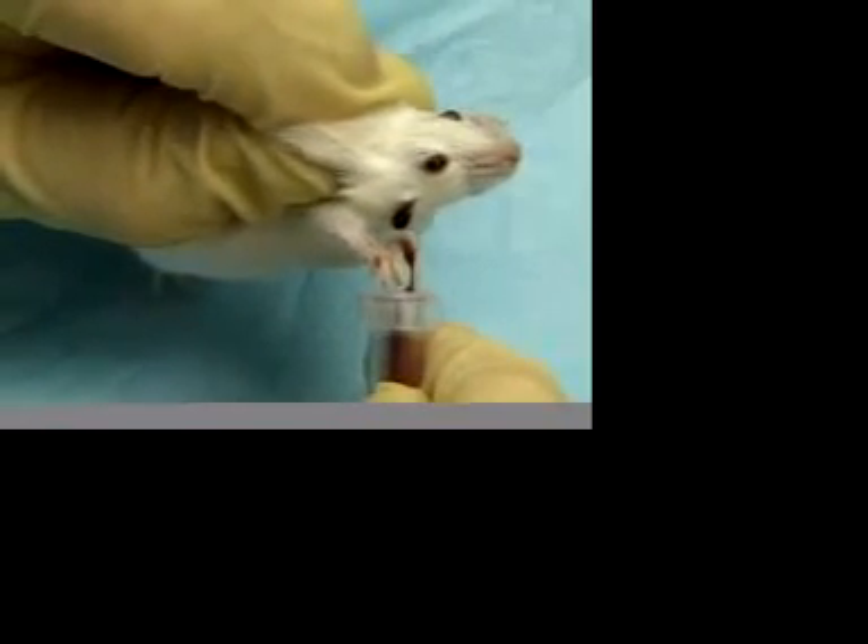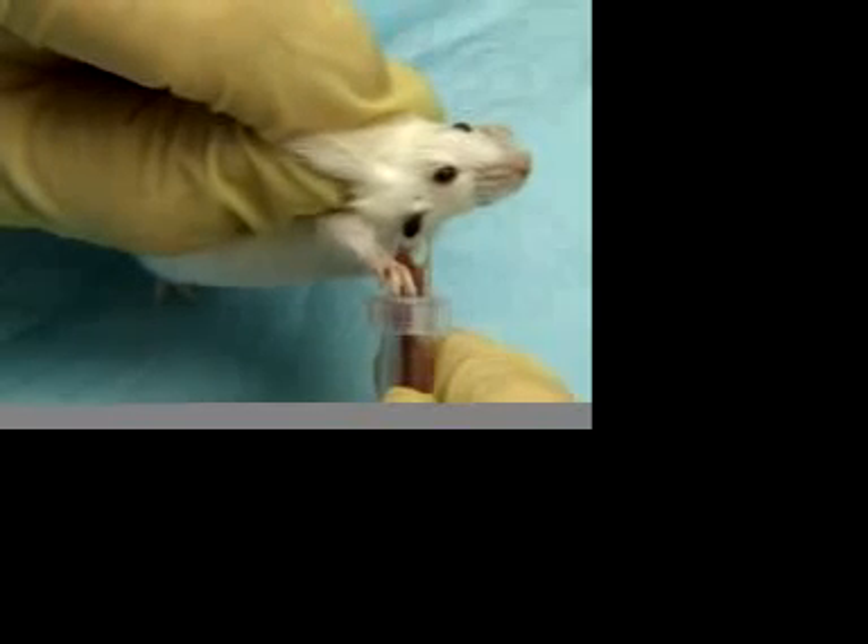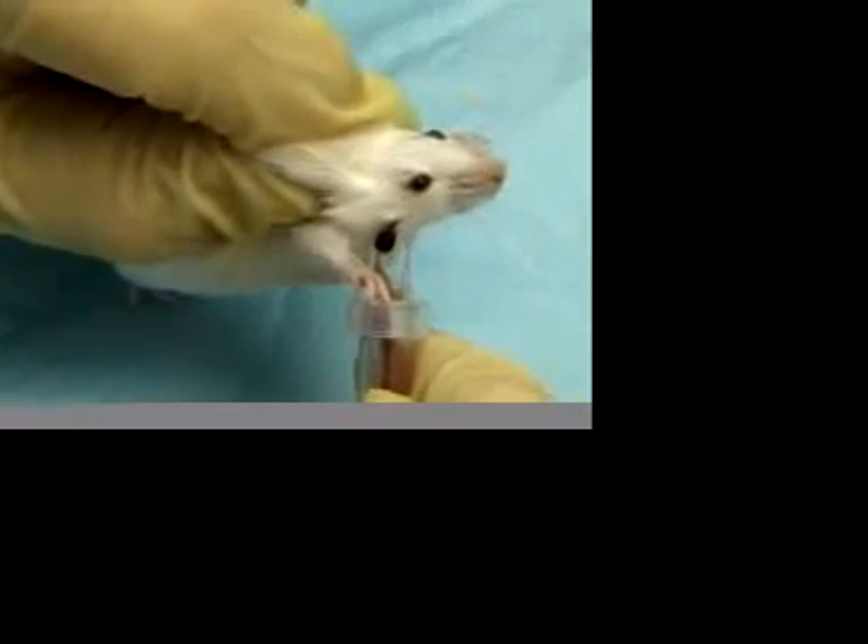Using this method, the animal is alert and suffers only incidental and momentary trauma — specifically the stick with the lancet.